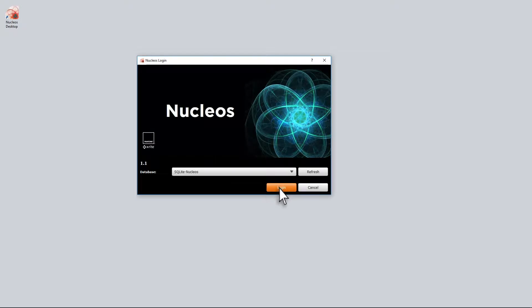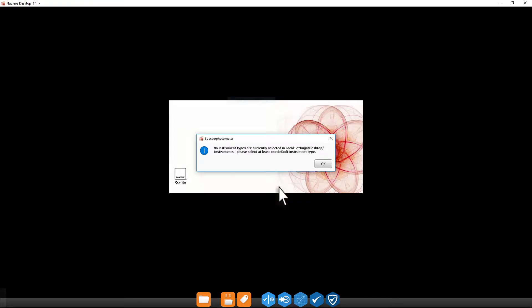Click login. If this is the first time running this software on your computer, you will receive this message. Just click OK.